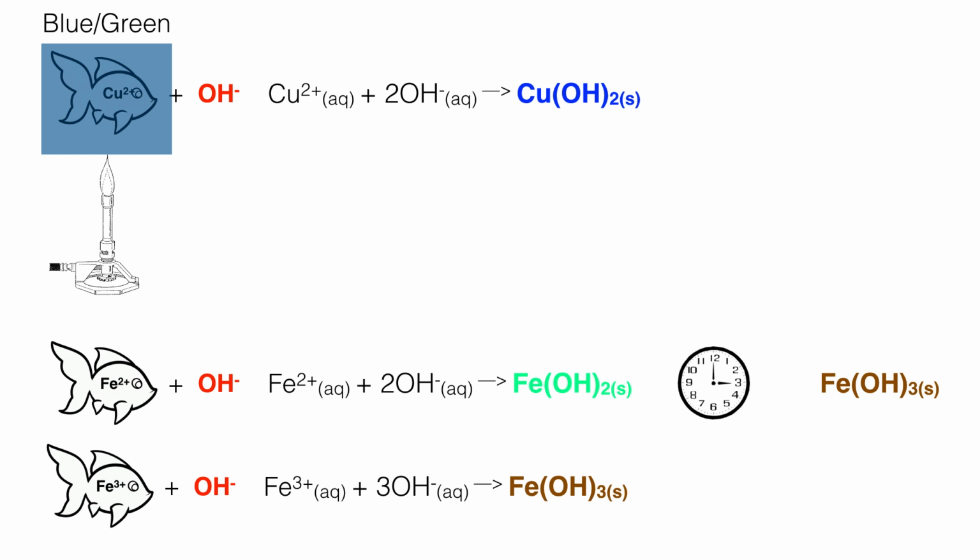For example, if you didn't eradicate the possibility of lead ions first, because lead is so precipitative, if you went and added sulfate to solution and you hadn't ruled out the possibility of lead, you would get, if lead was there, a lead sulfate precipitate, which is inconveniently white and looks just like barium and calcium. And without a flame test for lead, due to toxicity risks, you wouldn't be able to tell the difference between lead, barium, or calcium, and you wouldn't be able to distinguish between them.